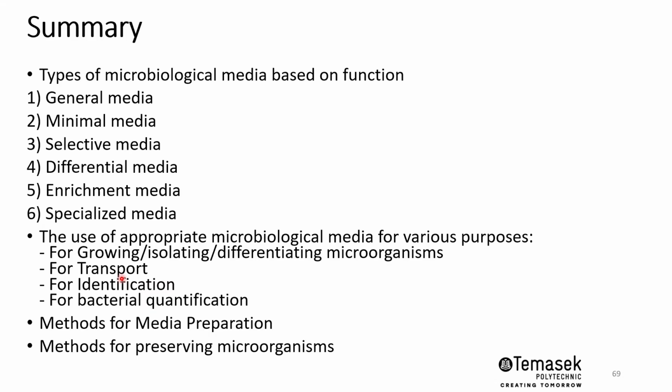And then finally, we talked about the different ways of short-term and long-term preservation of microbes. For short term, you can keep it in the fridge, or for long term you freeze it down with glycerol.